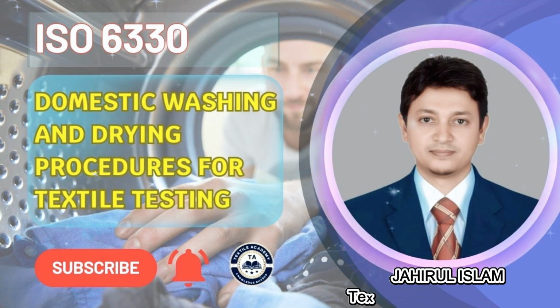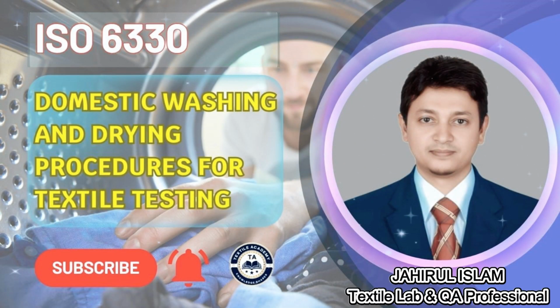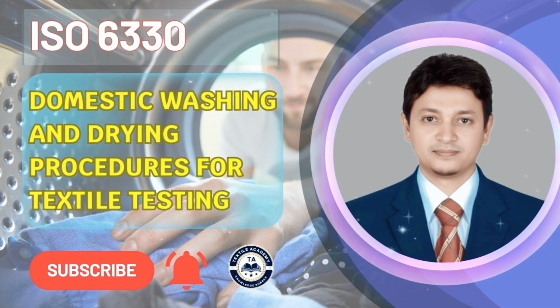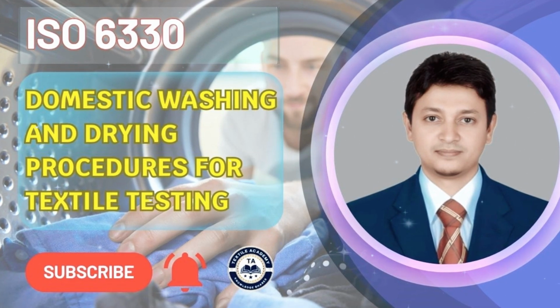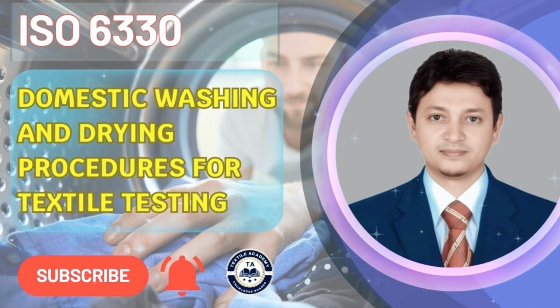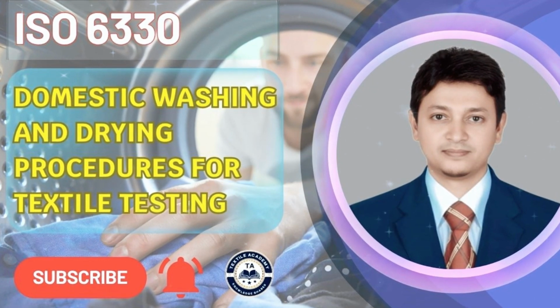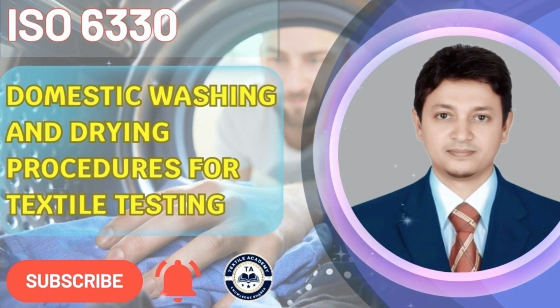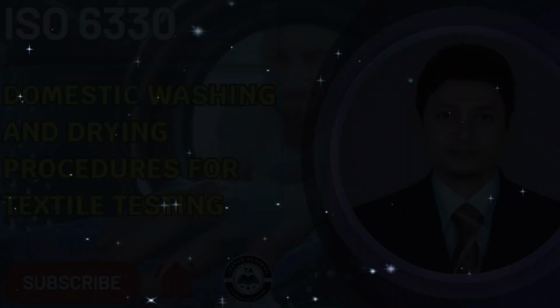Welcome to the training session on ISO 6330, Domestic Washing and Drying Procedures for Textile Testing. In this session, we will review the scope, principles, equipment, test procedure, and reporting requirements of this standard. The objective is to ensure accurate, consistent, and internationally accepted washing and drying simulations for textile evaluation.